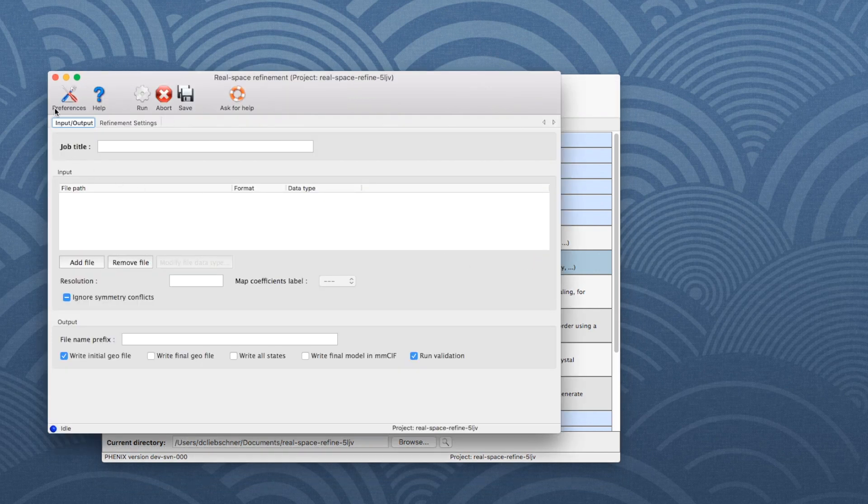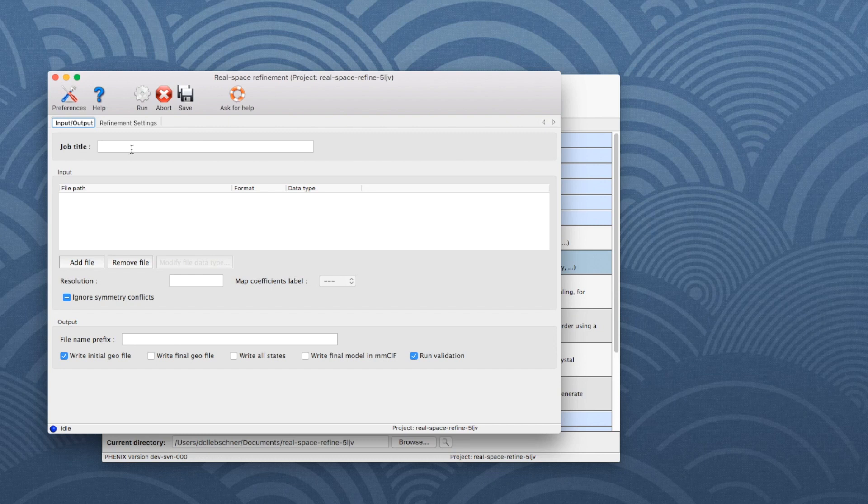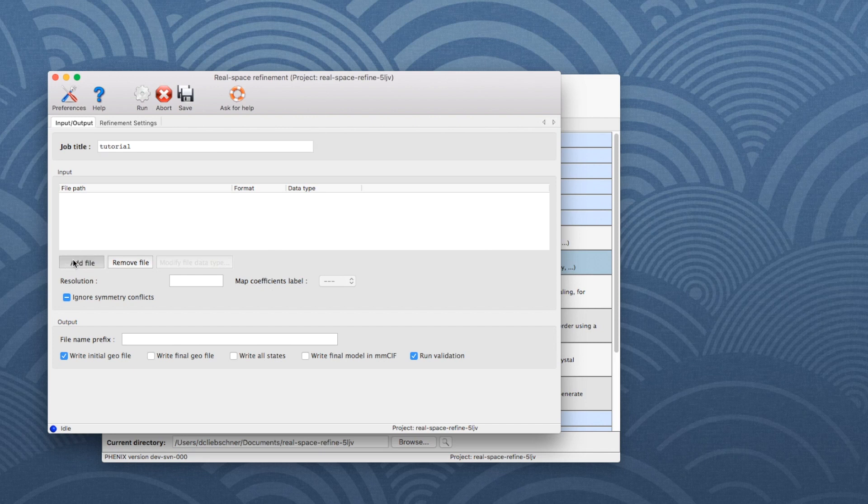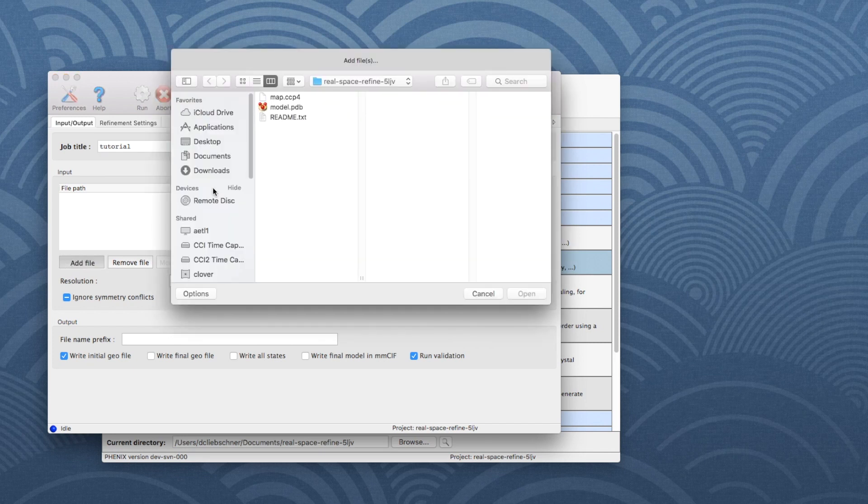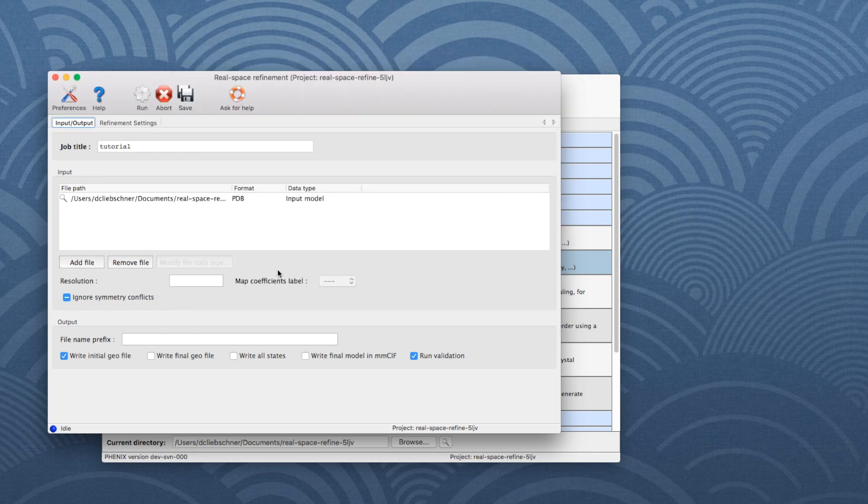Go first to the Input-Output tab. For bookkeeping, add a job title. Click Add File and select the file Model PDB. Then add the map.